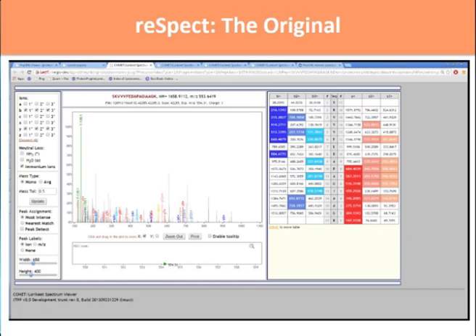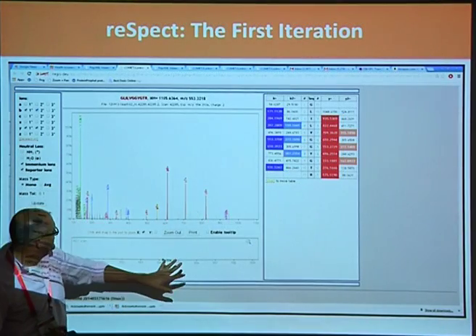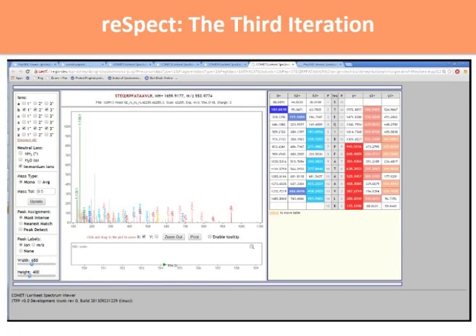So this is the original match. After the first pass search, you match all these peaks. You see that it has very good coverage and a very good ion series. There are a few peaks that are not matched, but overall this is a very good identification. After you remove those peaks and redo the search, you'll see that these 3 peaks here were right here. It's just hard to see, and they're grayed out. So over here you see that in the second pass, we identify this peptide, a very good match to the ion series. Remove those peaks. Second iteration, so the third peptide found in the same spectrum, found all those peaks. Then you remove them, and even a fourth peptide, in the third iteration, and you still find a fairly good peptide. So in this specific case, from one spectrum we found 4 peptides with high probability and good match.